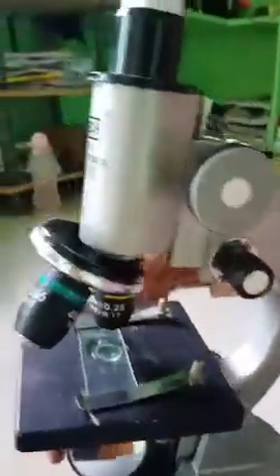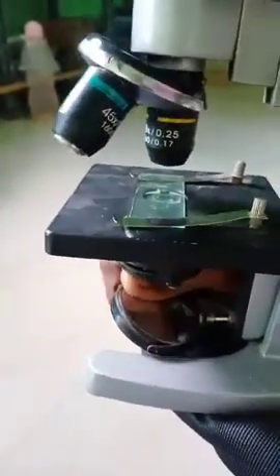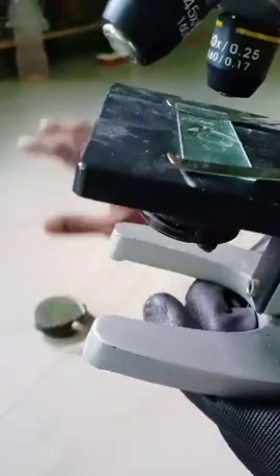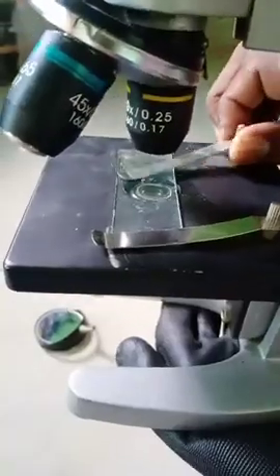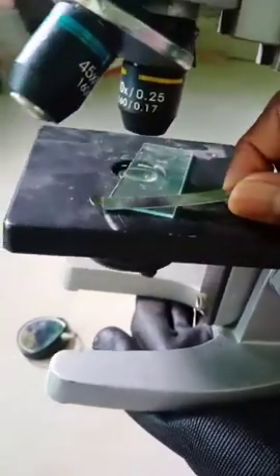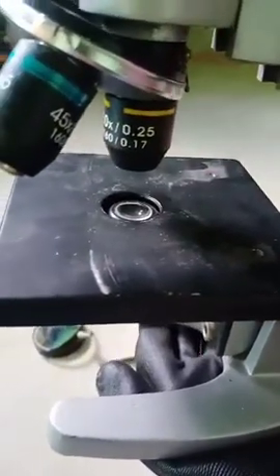Here we can dismantle this. Which one? The lens. We can dismantle this lens. We have dismantled it and kept it aside. We can dismantle these clips also, and keep them aside. The slide also we kept down.